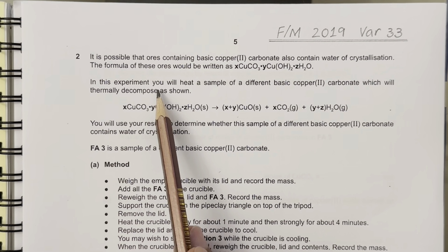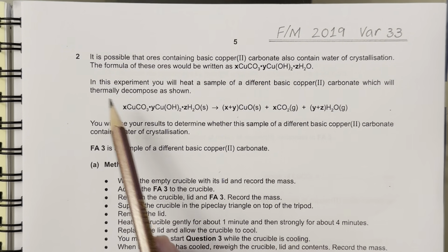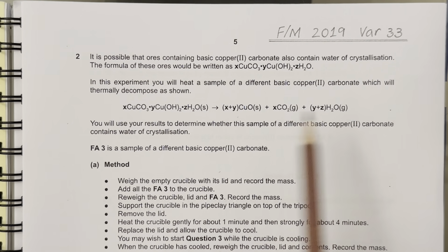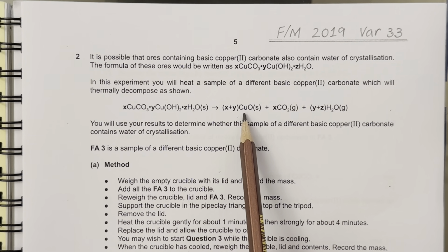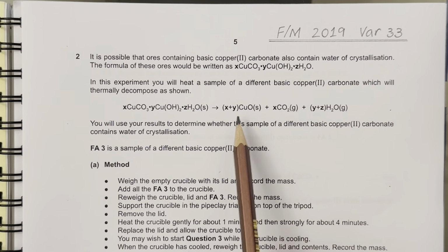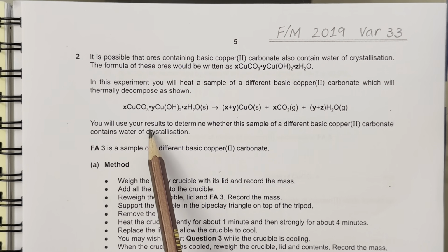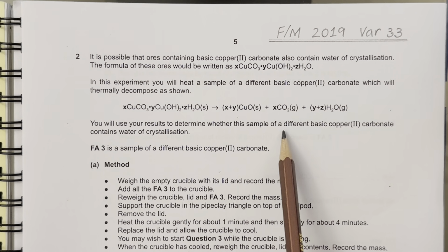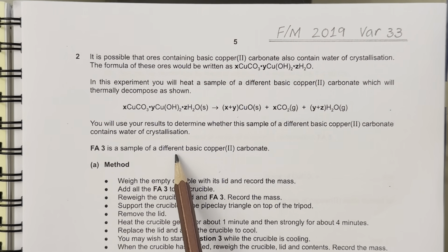In this experiment, you will heat a sample of different basic copper II carbonate, which will thermally decompose as shown. So when it decomposes, copper II carbonate also, copper II hydroxide also, gives off copper II oxide, carbon dioxide and water. These two will be released in the form of gas and just copper II oxide will be remaining as solid. You will use your results to determine whether this sample of a different basic copper II carbonate contains water of crystallization. FA3 is a sample of different basic copper II carbonate.